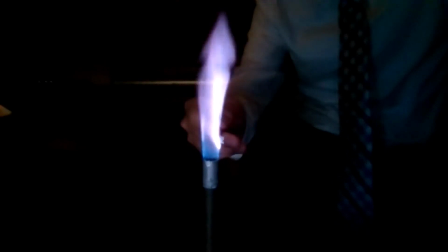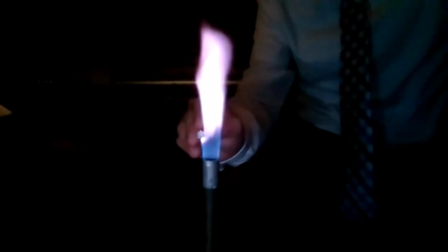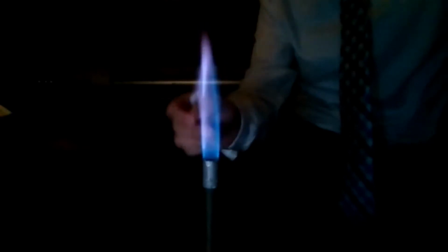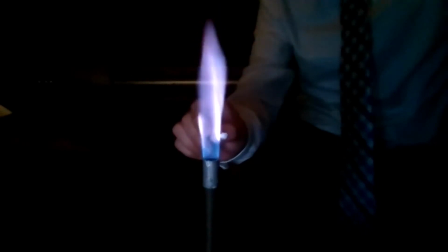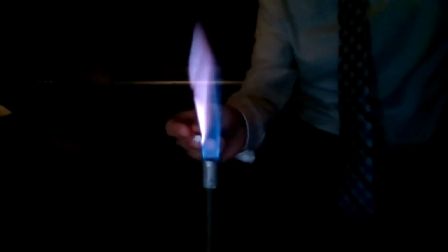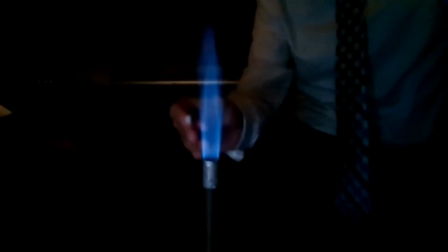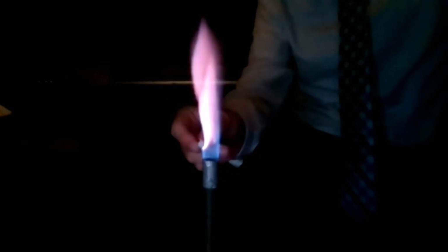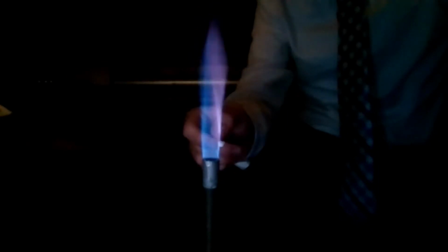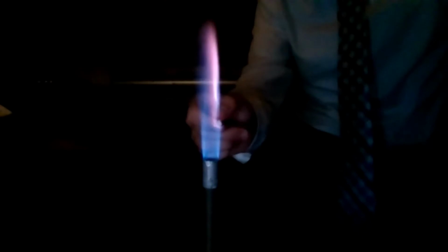So what color would you say potassium is whenever it burns? Purple. Yeah, it's like a nice purple color. Why is it purple again? What's physically happening? The flame is physically turning purple. But why? I don't know. What's happening to the electrons? It's going to an excited state and then dropping to the ground state.